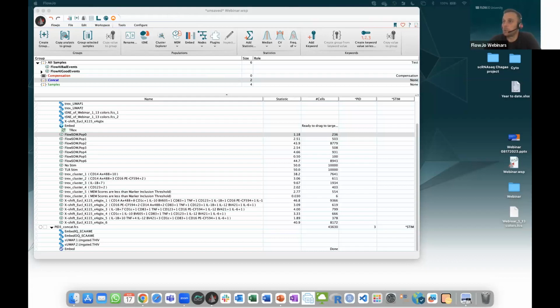If you want to add a new sample to a bigger data set after some time, does it make sense to concatenate everything again and then use embed to do the analysis again? Yes, I think so. You can use embed in different ways.